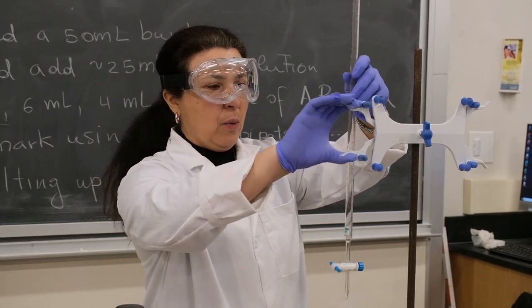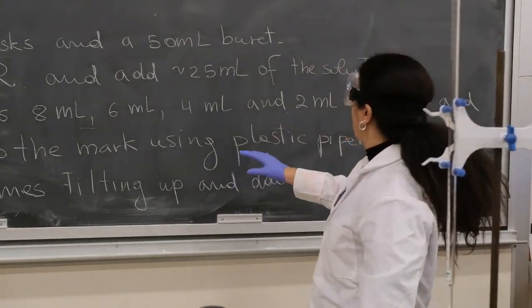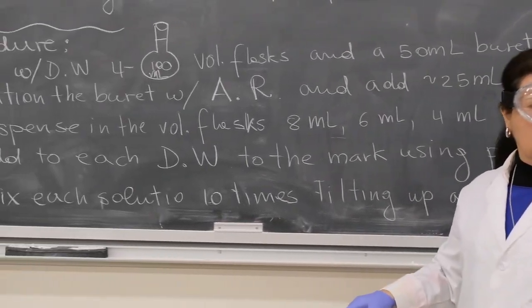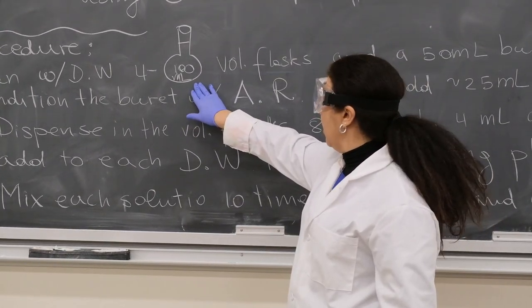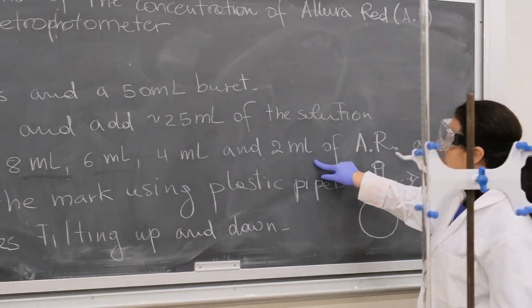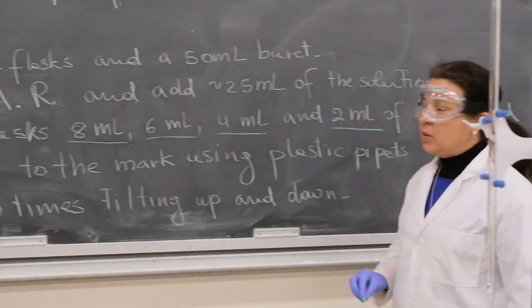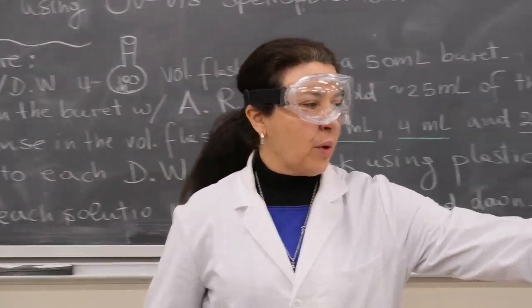Once you have done that, we're going to fill the burette with approximately 20 to 25 milliliters of Allura Red. Let's not use more than that because it's not necessary, it will be a waste. And then what you're going to do is dispense in the four volumetric flasks that have been cleaned with the deionized water, 8 milliliters, 6 milliliters, 4 milliliters, and 2 milliliters of Allura Red. So you add these amounts exactly using the four significant figures for your burette, okay?